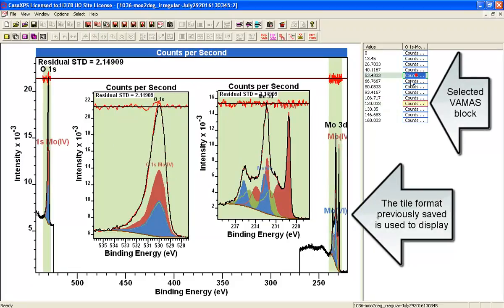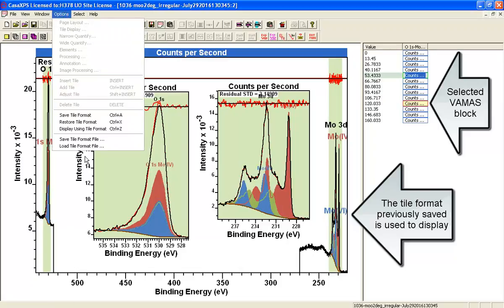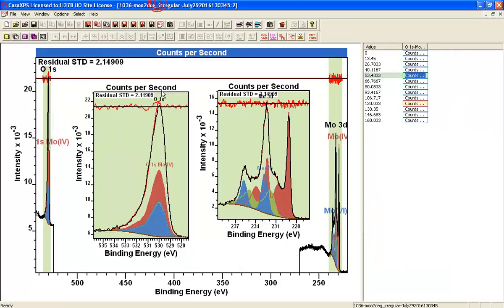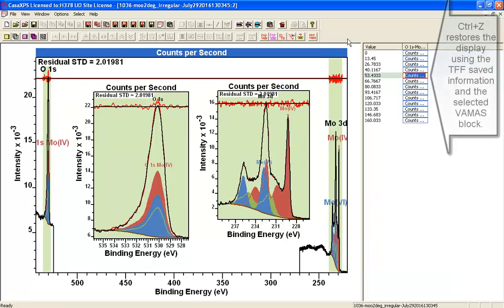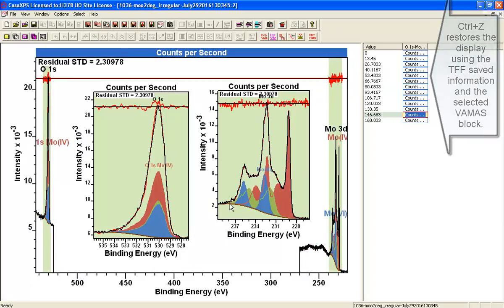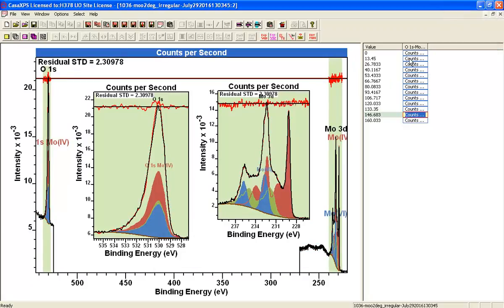I can select another one — the options menu tells you that's CTRL-Z. So if I do CTRL-Z, I've moved and displayed the selected VAMAS block, so I can get a different perspective of this measurement. This is a sequence of measurements that are all identical, just spaced in time.